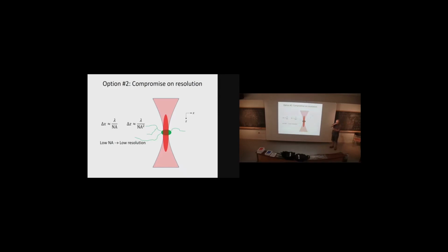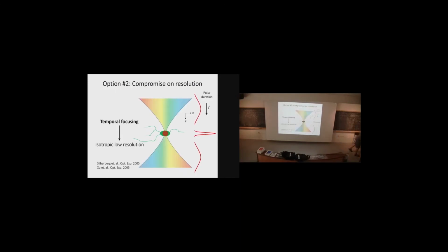First of all, it's very inefficient, because there's a lot of excitation going on here that's not even looking at the neuron. Second, if there's another neuron above or below, you'd be confused as to which neuron you're looking at. So how can you address that issue? How can you generate more of an isotropic resolution with your microscope? I guess the solution is we have to get away from these laws of what defines delta x and what defines delta z.